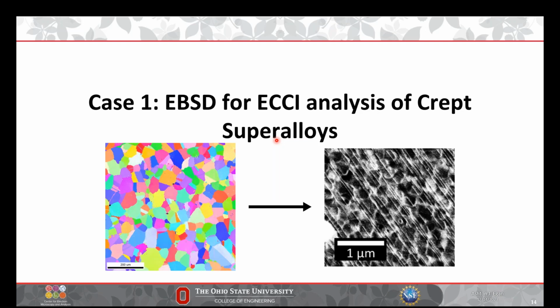And so I want to look at the deformation structure of both. And so how do I do that, right? How do I go from EBSD maps that I can take telling me something about the orientation of each of these grains in this alloy and go to something like this on the right where I can see defects shearing through precipitates. And recall that I mentioned about microtwins. Basically what we want to look at and focus on are these sort of red grains, which are 001 type grains, and we'll just limit our discussion to that because this was the critical thing for the study.